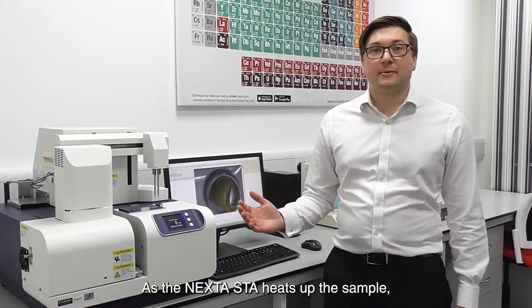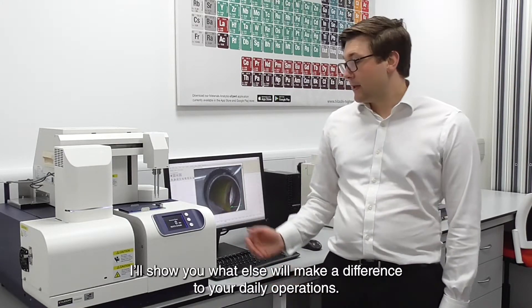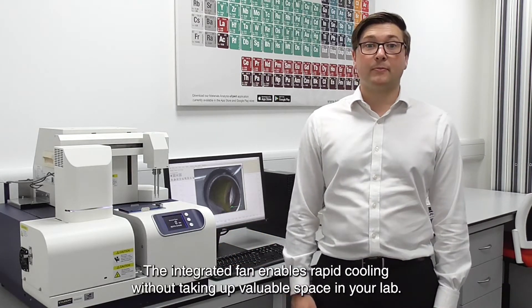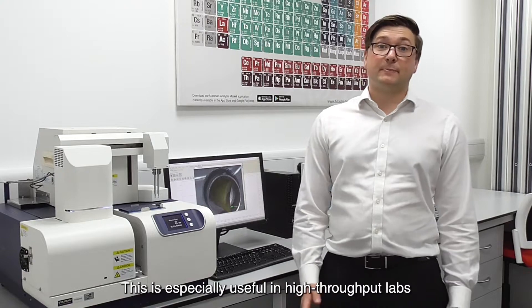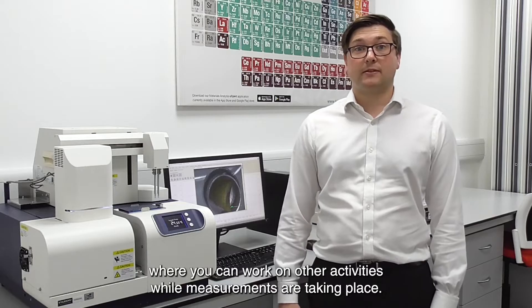As the Nexter STA heats up the sample, I'll show you what else will make a difference to your daily operations. The integrated fan enables rapid cooling without taking up valuable space in your lab. And the autosampler allows for the automatic analysis of up to 50 samples, especially useful in high throughput labs where you can work on other activities while measurements are taking place.